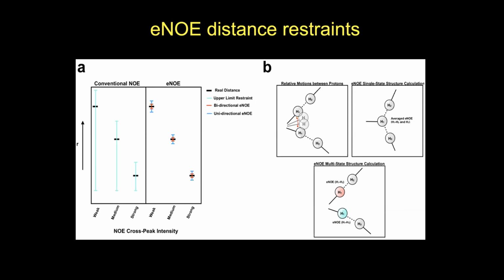This means that only the average of these states, or the back-predicted NOE of these states, on average have to agree with what we measure. For example, if you allow 2 states, you will end up with one position for proton 1 up here, close to proton 2, and the second one down here, close to proton 3.